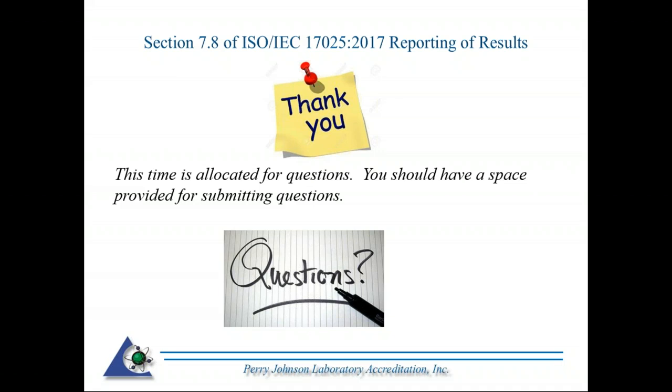So you have air velocity. You may have HEPA filters within the hoods, and depending on what's being tested on there, something that I think would want it to be tested and assured that it's operating correctly.